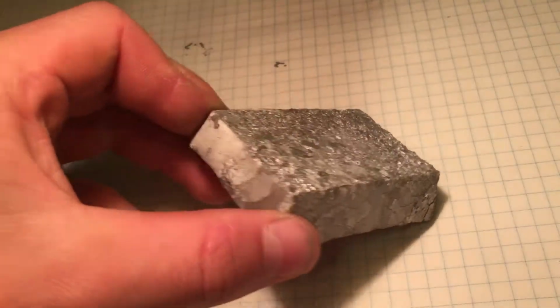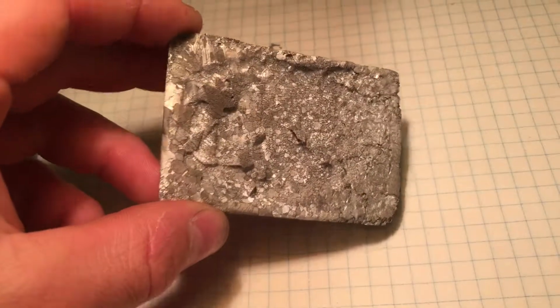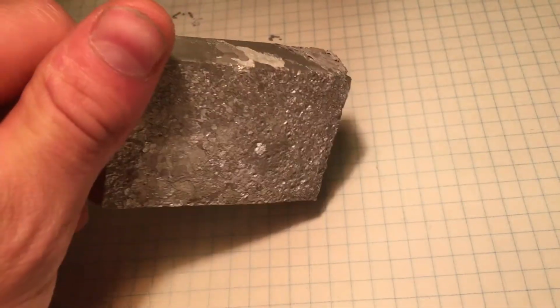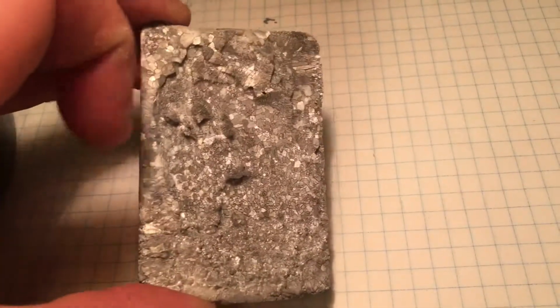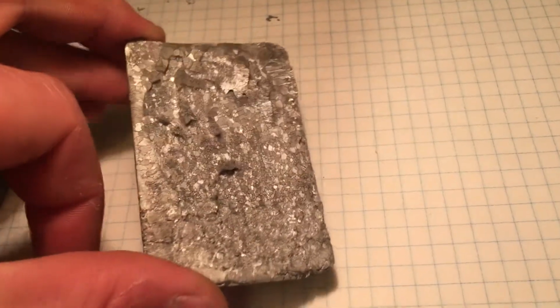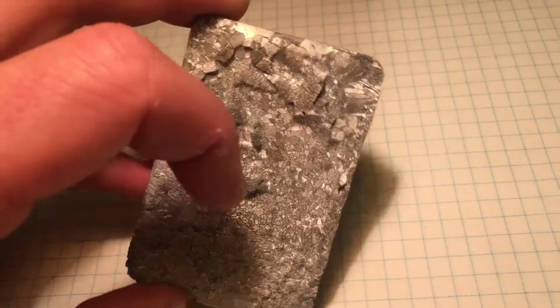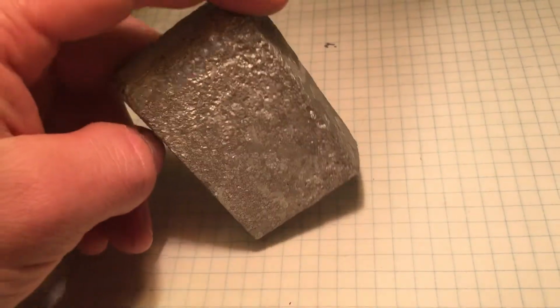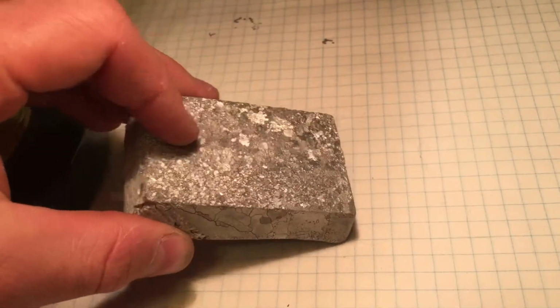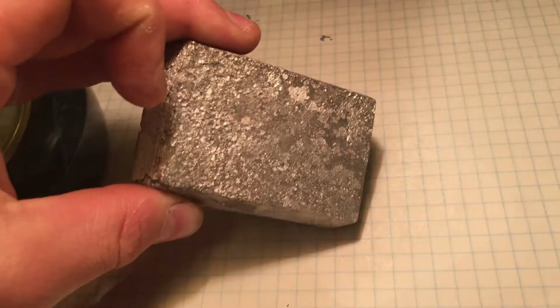Here I've got a piece of tin metal that's been etched by hydrochloric acid when I was making tin chloride, and you can see all the different grain boundaries in the metal, and they have different angles of refraction with light, and so they shine sort of like this. Anyways, today I have a need for ultra pure tin, so I'm going to mill some of this into fine shavings and then make some more tin chloride.